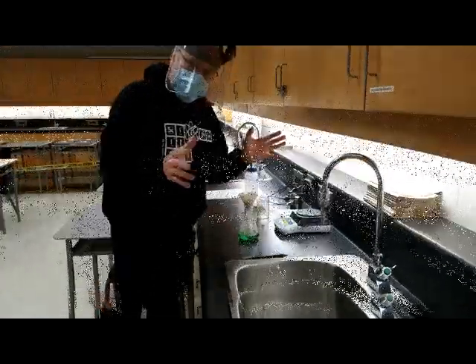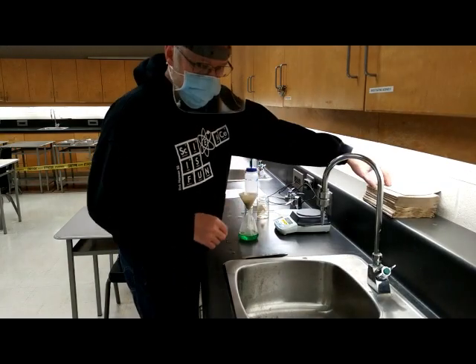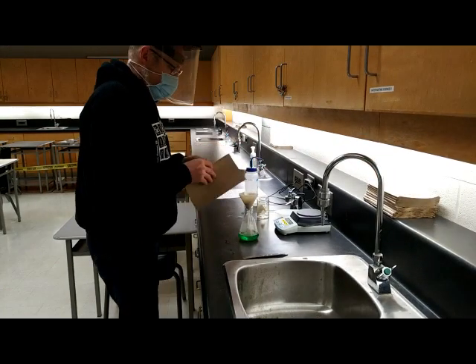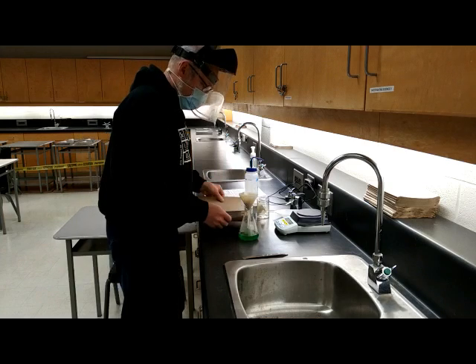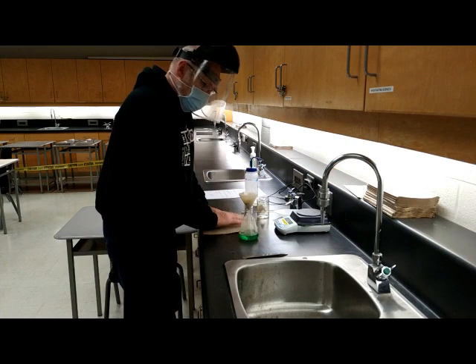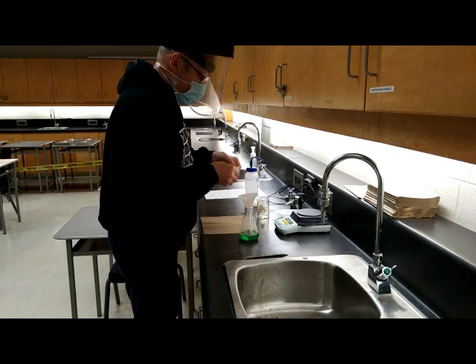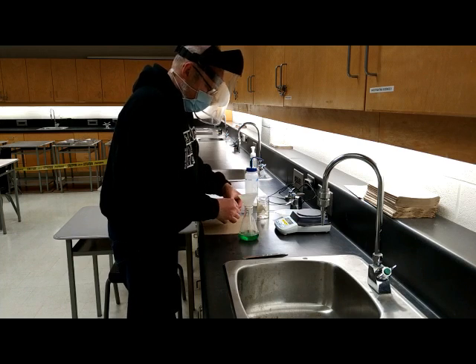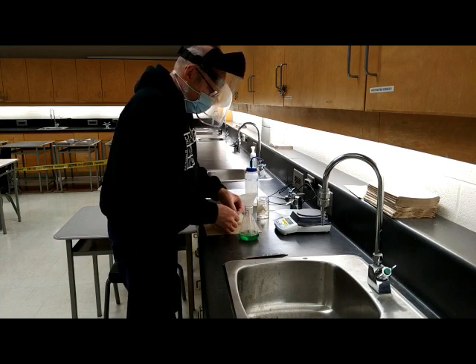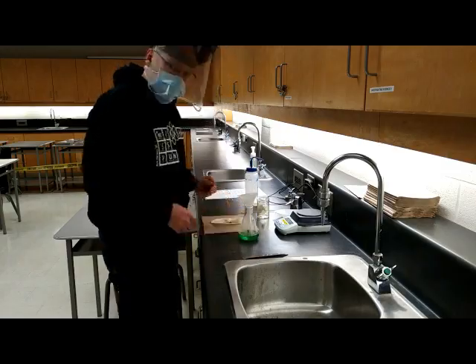Alright, so everything has been drained through now, and so we are at the point now where I'm going to lay out my material in order to dry, okay? So we'll just unravel that, and we'll let that dry overnight.